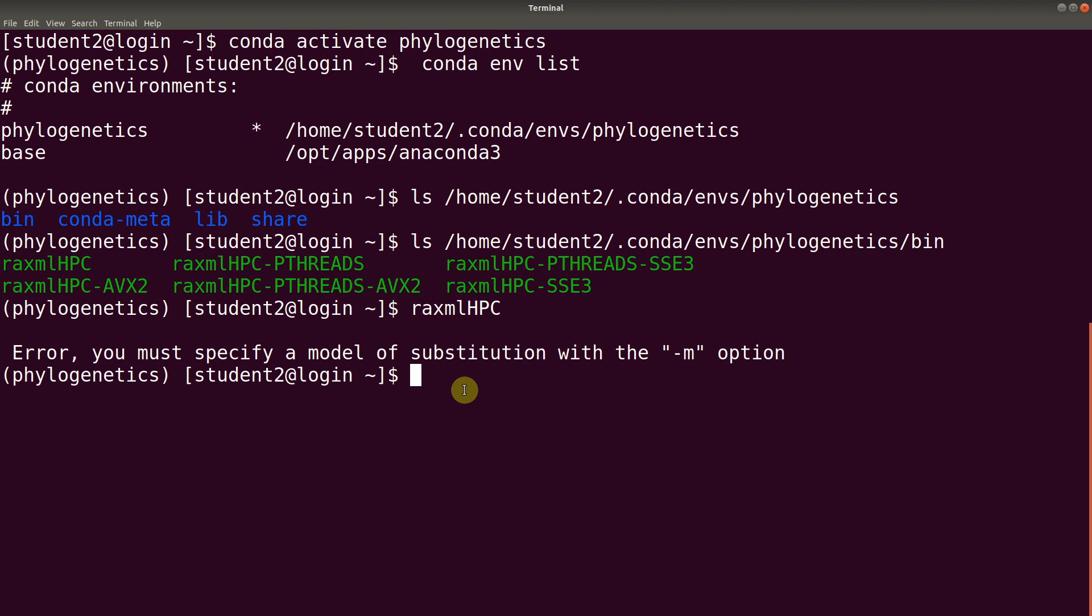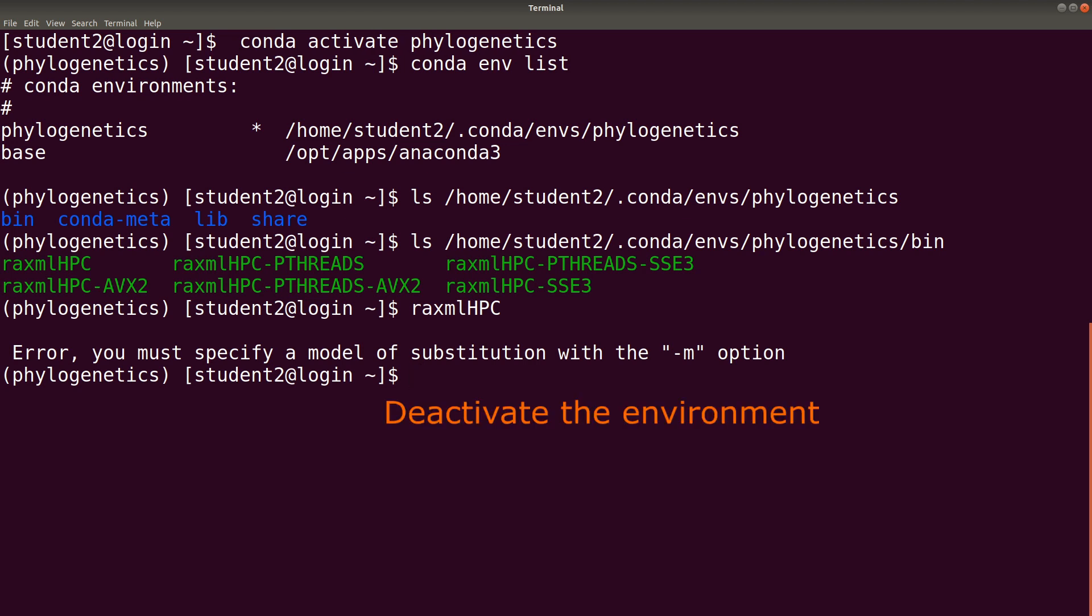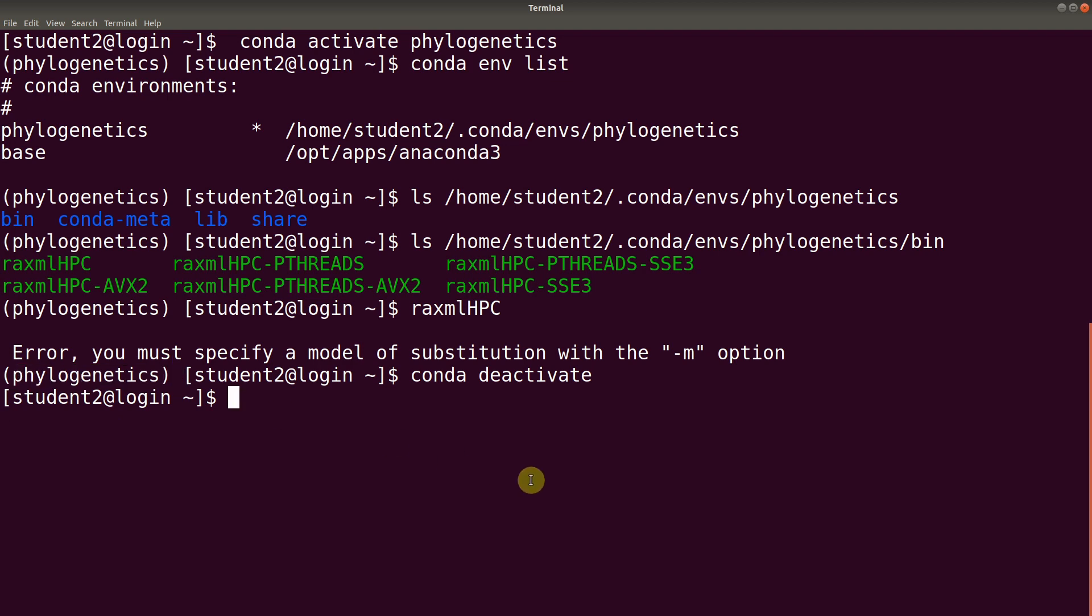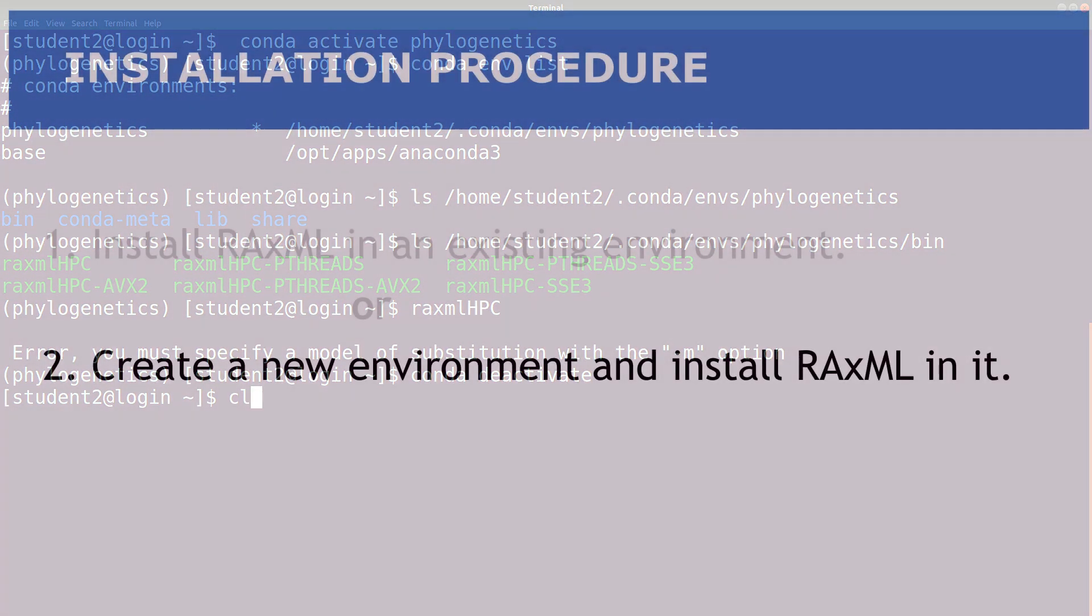Now, let's look at the second approach where we install, where we create the environment and install RAxML at the same time. But before we do that, let's deactivate this environment. We say conda deactivate. It has been done for us. So, notice that we no longer have this name here. Let's start on the new screen.